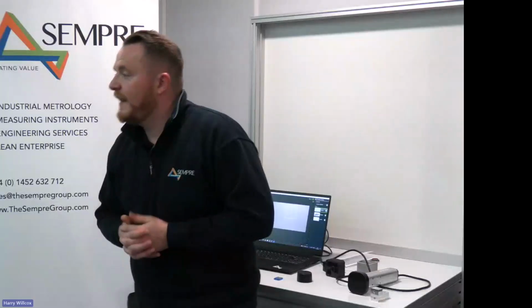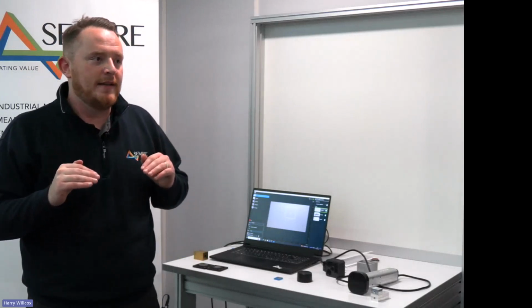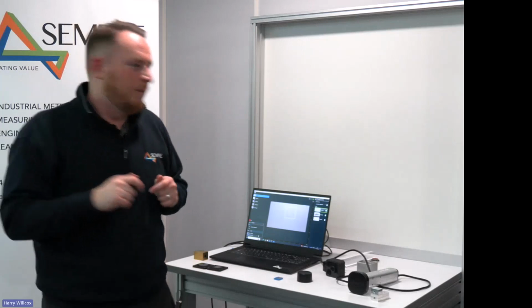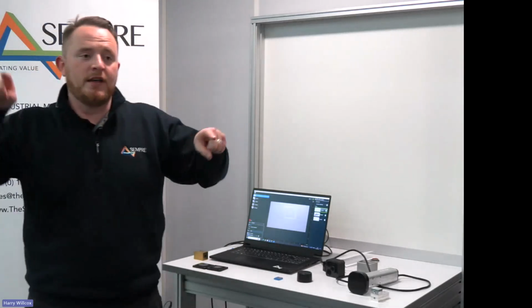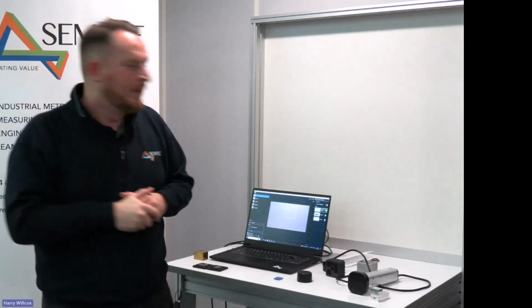Can you measure surface flatness? The way that we would measure surface flatness is looking at the maximum deviation over the area. We would have to define what's called a scratch function, and what we'd be looking at doing is taking the minimum and maximum points, which is effectively your flatness value.